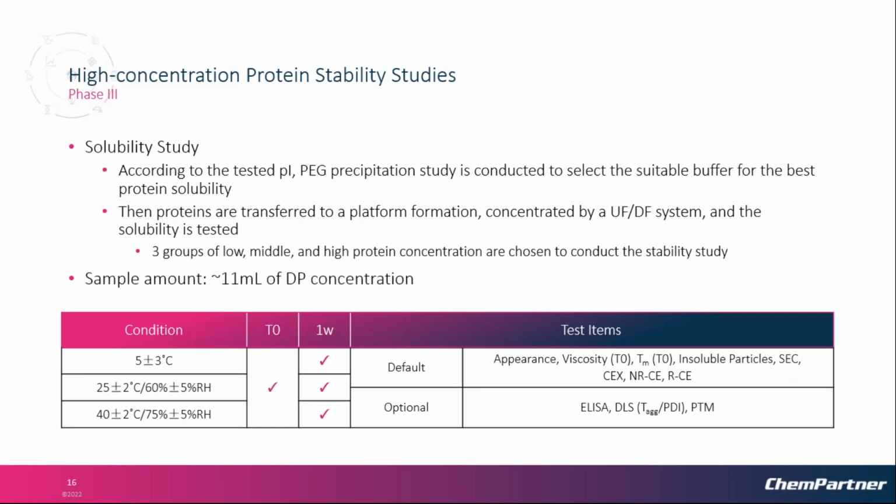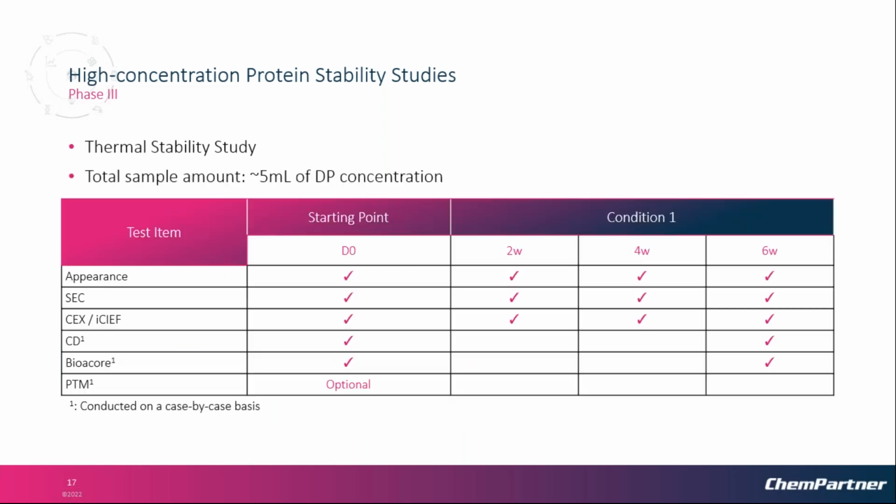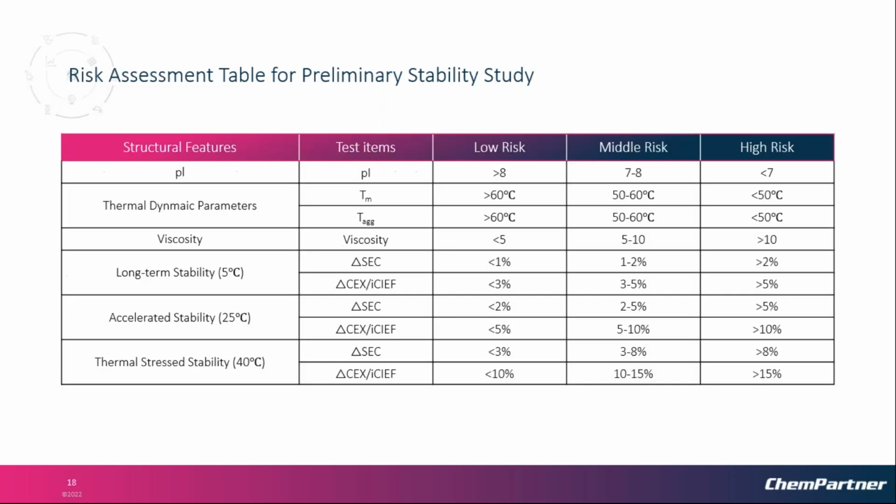For the candidates with high protein concentration, an additional stability study will be needed. We will test their solubility by a PEG precipitation method, and we will also test their viscosity and do some preliminary stability studies.